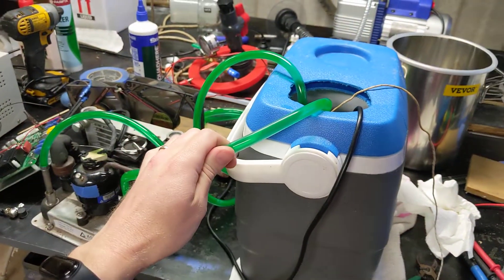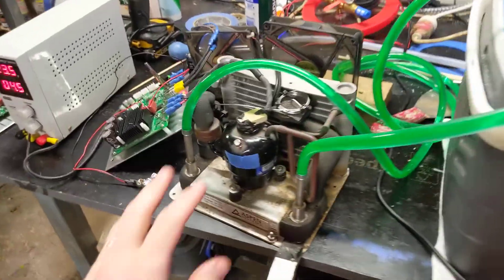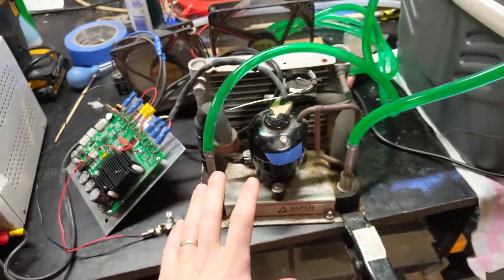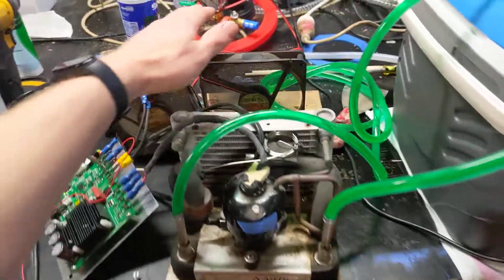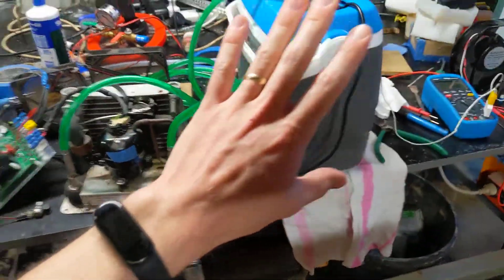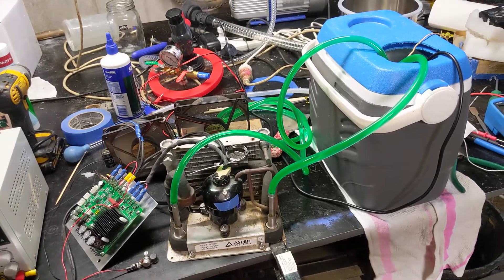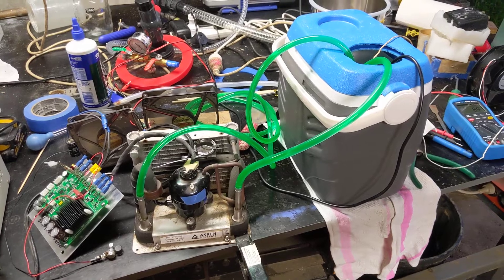The green stuff is a 50/50 ethylene glycol water mix. This is a little chiller unit controlled by this control board. It's pulling a bunch of power, and I've got some 12 volt fans blowing on it. This whole setup should replace the dry ice so I can run vacuum dried food without having to shell out for dry ice all the time.